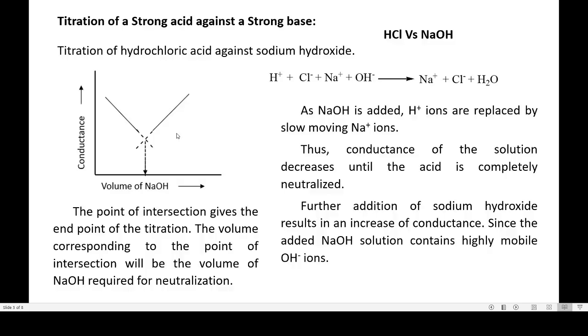Further addition of sodium hydroxide, that is, after the end point, results in an increase of conductance. This is due to the addition of highly mobile hydroxide ions. Thus, conductance starts increasing due to the presence of hydroxyl ions.